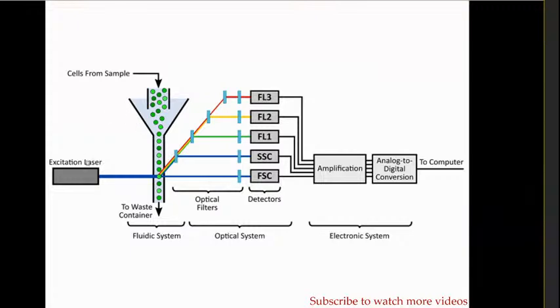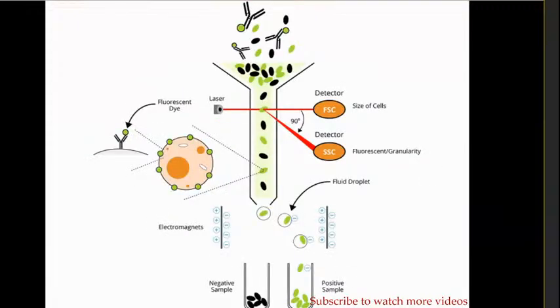Here they mentioned how it detects. Here it's the laser beam formation. Here they pass the sample. This sample is having various receptors on the cell surface. It's expressing as various signals through the detectors. These detectors help transfer and amplify the signal into digital conversion. This digital conversion is given as an input to the system. Here, how the cells are understood and recognized on the cell surface.